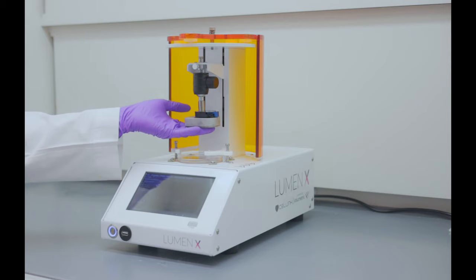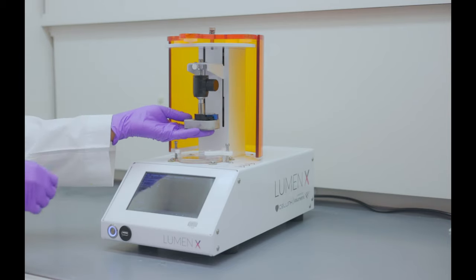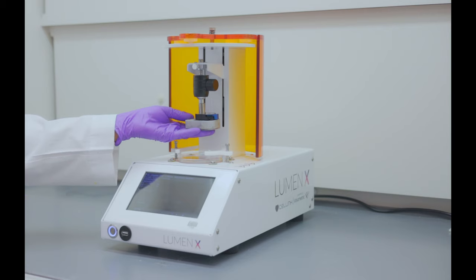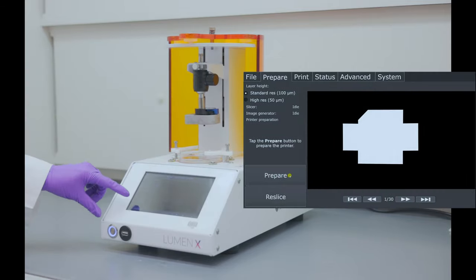Next, to prepare the build platform, loosen the metal screw while holding the build platform from the bottom. Now, the build platform can move freely in the Z axis. Push the build platform all the way up and tighten the screw.